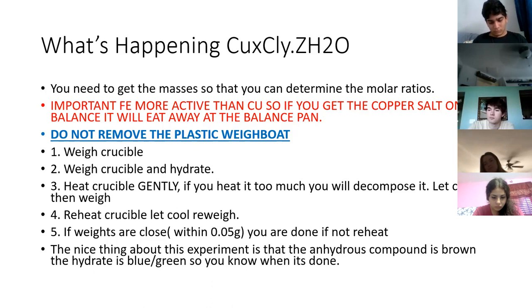We need to heat this gently. What happens if you heat it too hard? You literally will fuse the copper out of the copper salt and decompose it. And you'll ruin both the crucible and your experiment. You're going to heat it. Let it cool, weigh it. Then you heat it again. We did this last week.